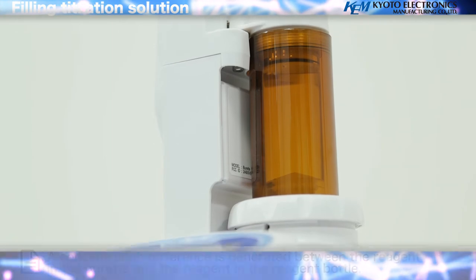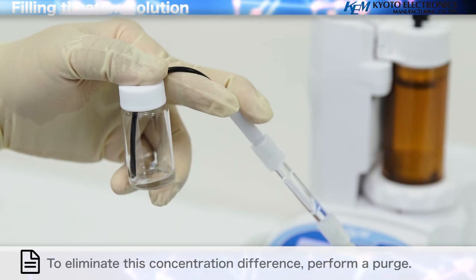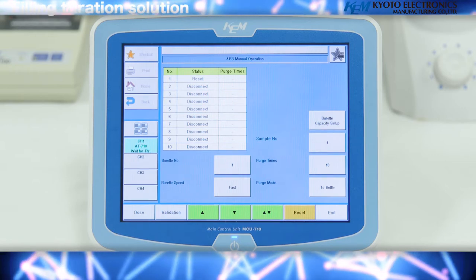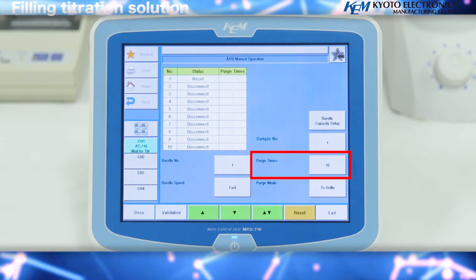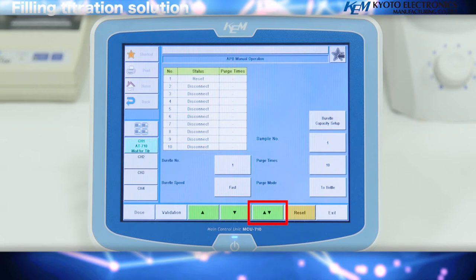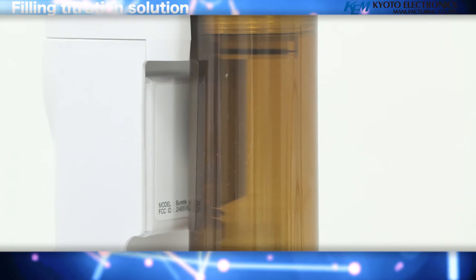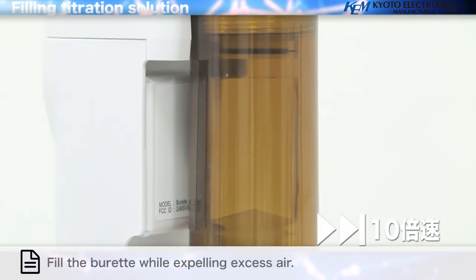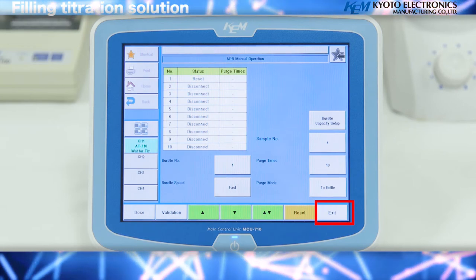Filling titration solution: a concentration difference is generated between the reagent in the burette and the reagent in the reagent bottle. To eliminate this concentration difference, perform a purge. Select the burette on screen, select Purge mode, select 2 bottle, set the number of times to purge to 10, and press the up and down arrow keys to activate the piston 10 times to fill the burette while expelling excess air. When the burette has been filled, press the exit key and return to the top screen.